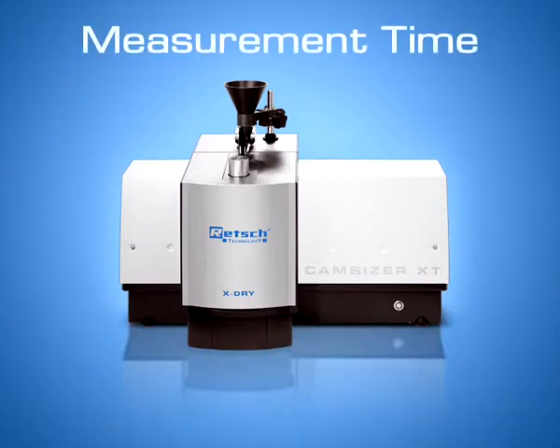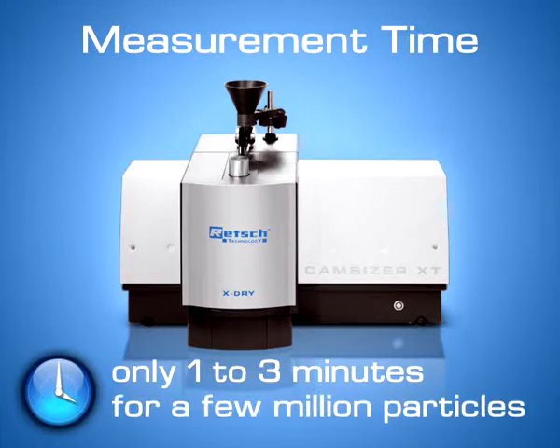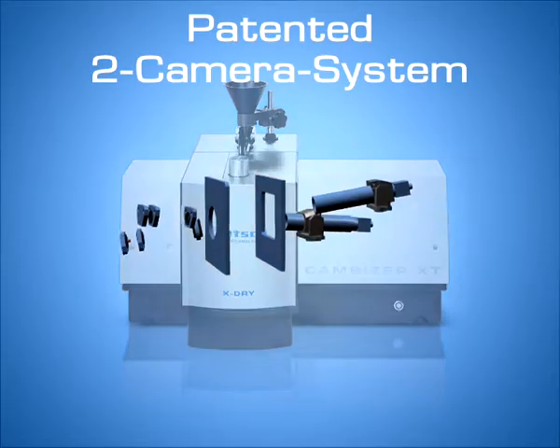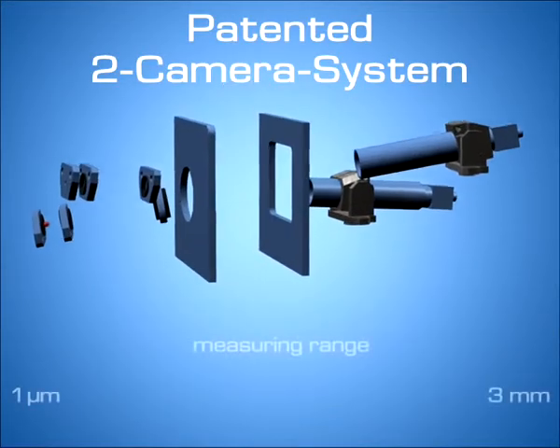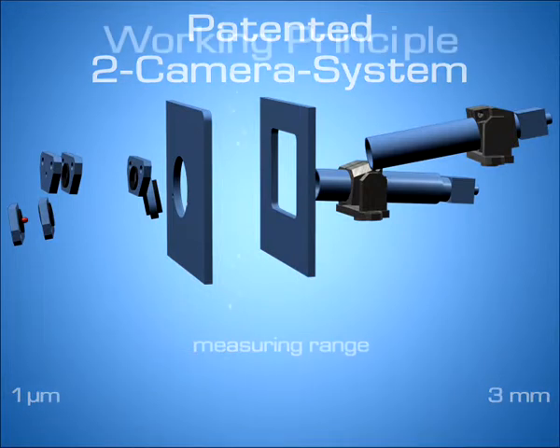The CamSizer XT measures large and representative samples in only one to three minutes, analyzing typically a few million particles. Thanks to the patented two-camera system, the CamSizer XT covers an extremely wide measuring range from 1 micron to 3 millimeters within one measurement run.